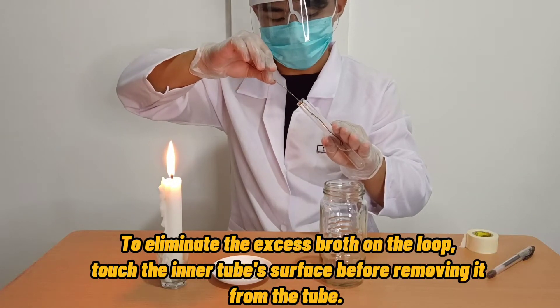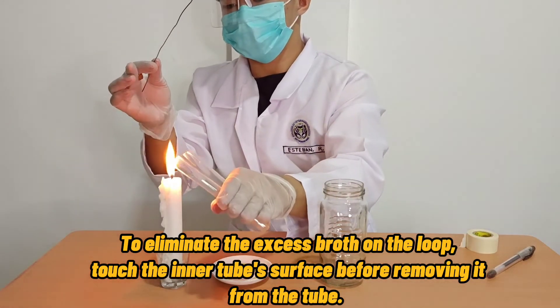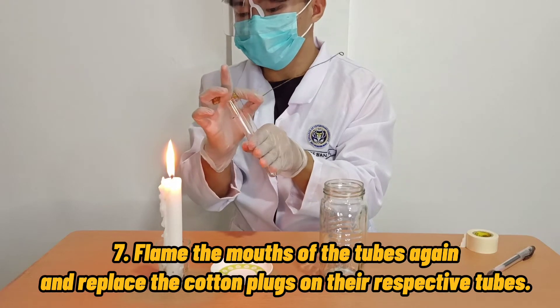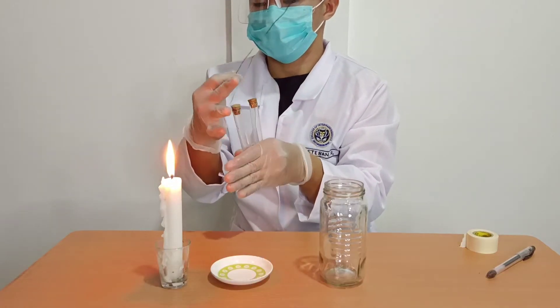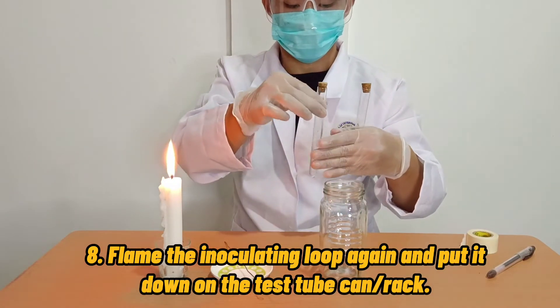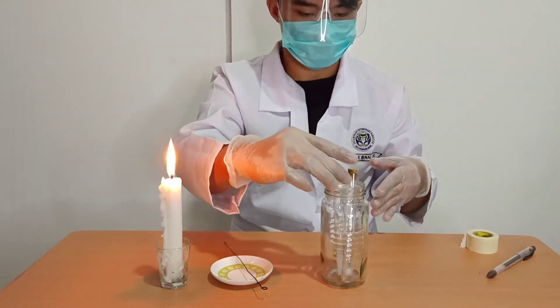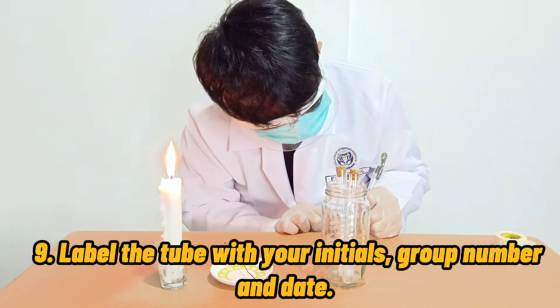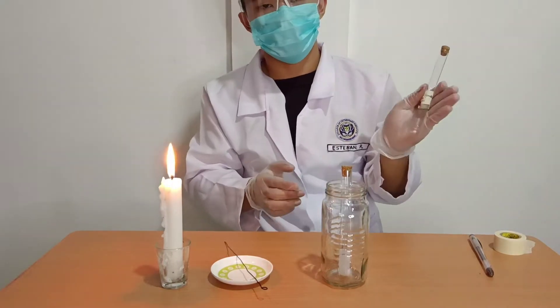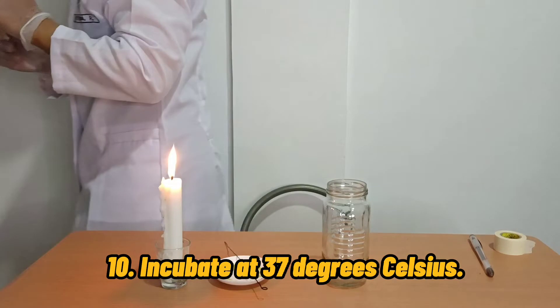To eliminate the excess broth on the loop, touch the inner tube's surface before removing it from the tube. Seven, flame the mouths of the tubes again and replace the cotton plugs or cork on the respective tubes. Eighth, flame the inoculating loop again and put it down on the test tube rack or can. Ninth, label the tube with your initials, group number, and date. Afterward, incubate it at 37 degrees Celsius inside the incubator.